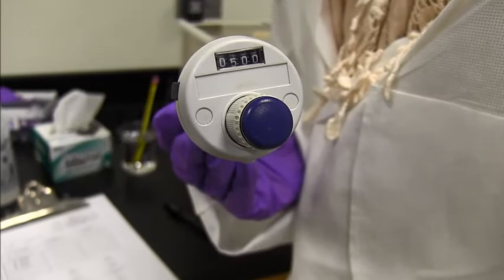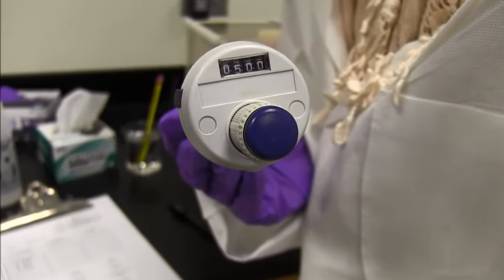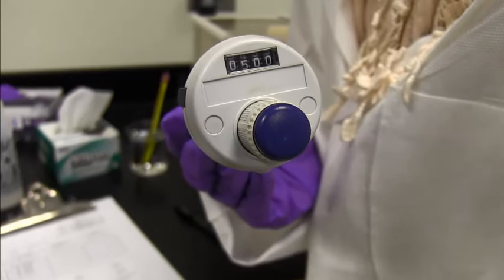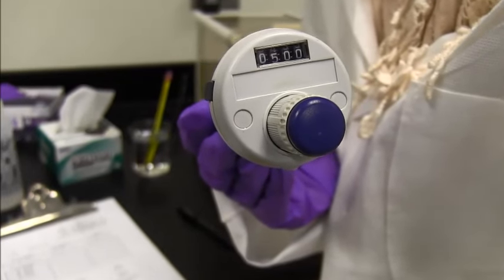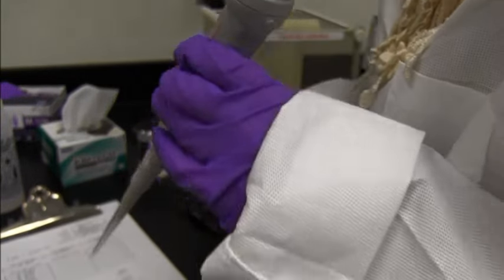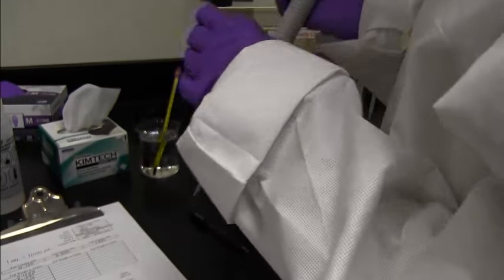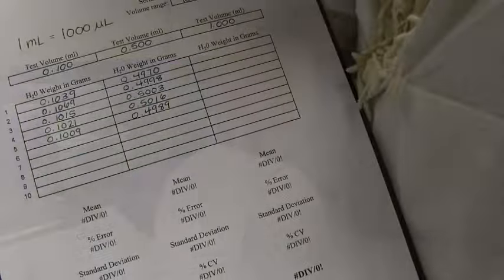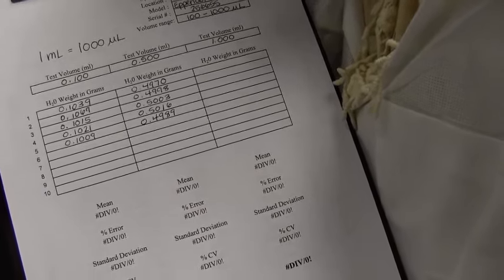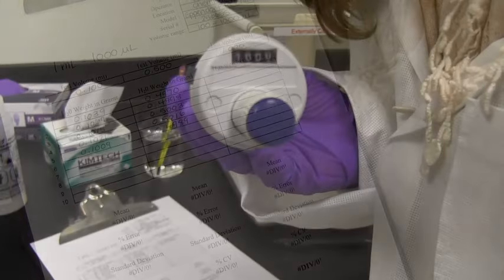Now that we're doing 500 microliters, I have set the pipette to see 500 on the display. And now we're going to repeat, taking the 5 replicates of the weight of the water. So we'll do the same thing that we did for the 100 microliters. So now that I've done the 0.5 mils 5 times, I'm going to move on to do the 1 mil.